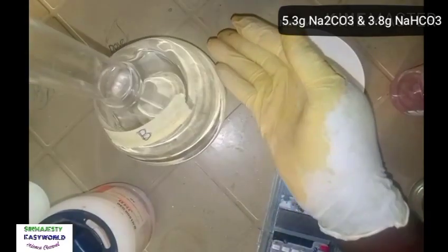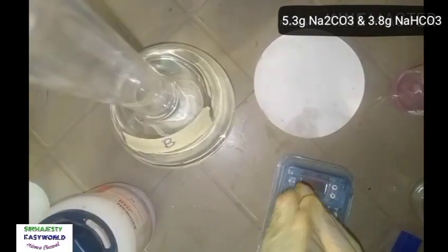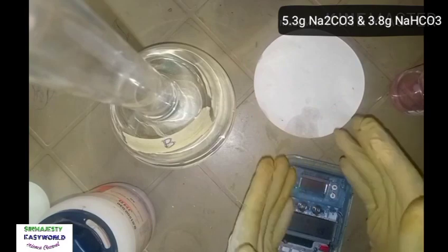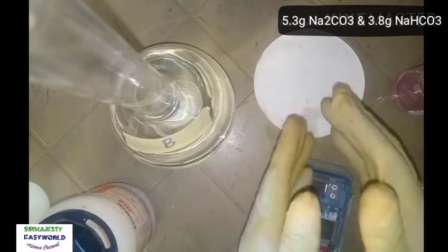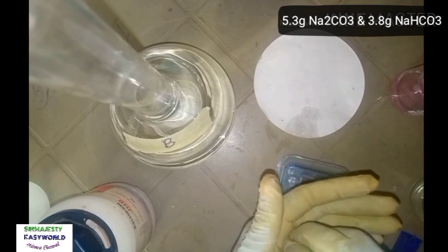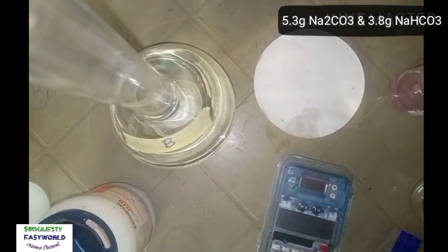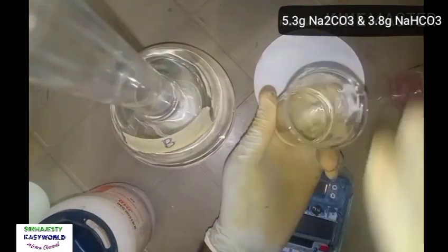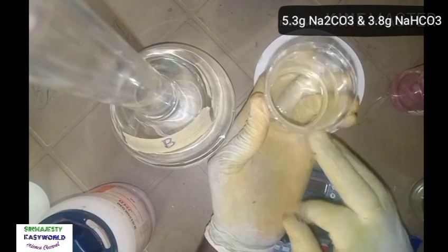What you do is just add up to half. Just use distilled water and fill it to half. Then when you fill it to half, you can now bring a 500 ml beaker and fill the 500 ml beaker up to the 300 cm cube mark. Let's assume this is the beaker, but this is 100 ml. Just fill it up to 300, or more than half of the 500 ml.